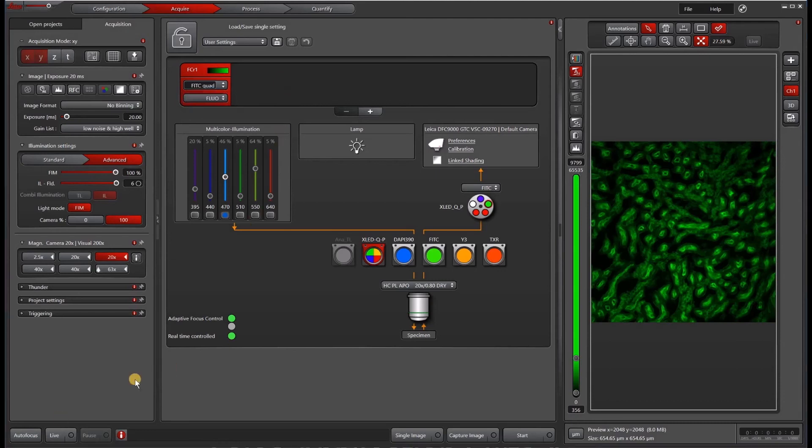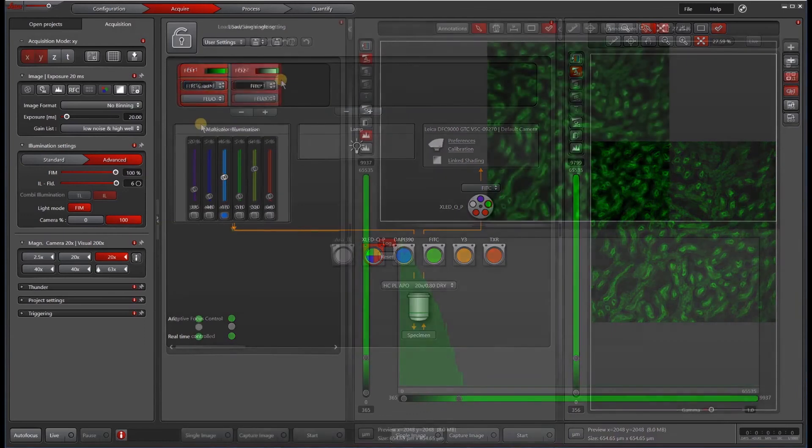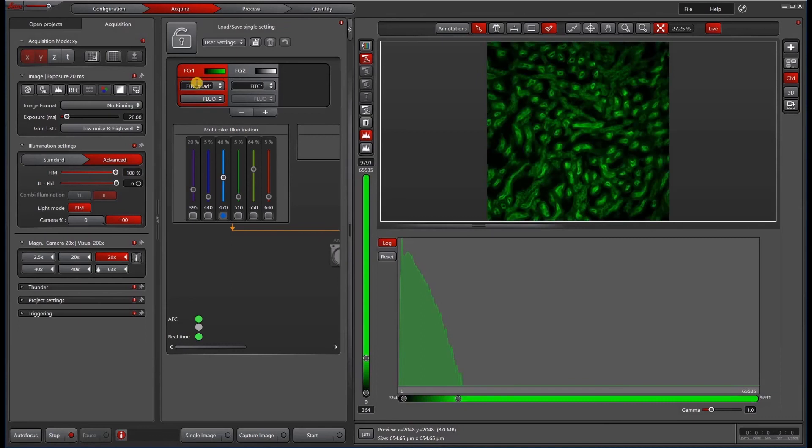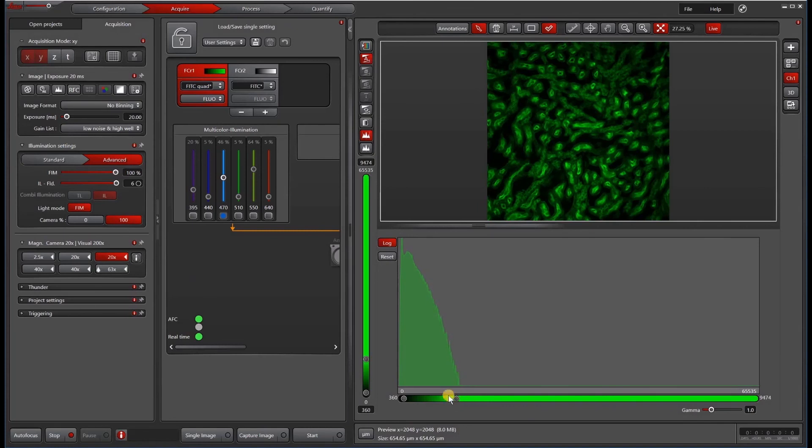So the last thing I want to go over is what is the difference between using that single cube and that quad cube? Well, let's compare side by side. Just with the side by side comparison, let's go live with the FITC quad and you'll see that this is the histogram. I have this on auto scale and the highest intensity pixel is around 9,500.